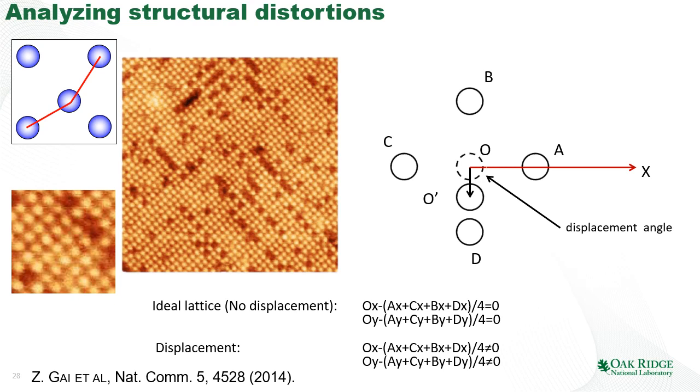What are we going to do next? We went through all this exercise of finding atoms and finding vacancies. What can we learn from this data? The first question would be, do we have any kind of physical model that will tell us what to look for? And very often this physical model would be suggested by the examination of the image.